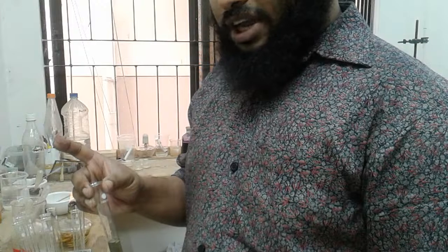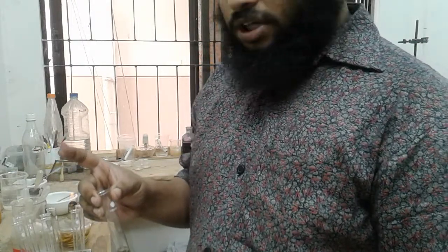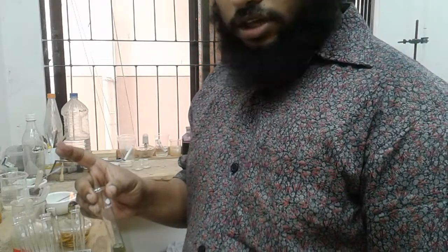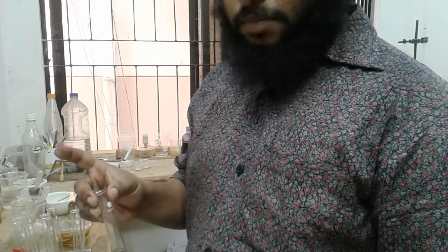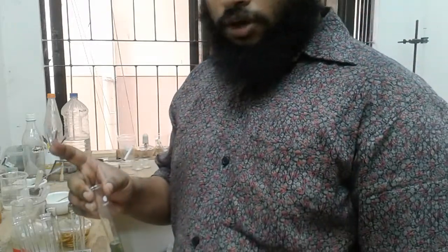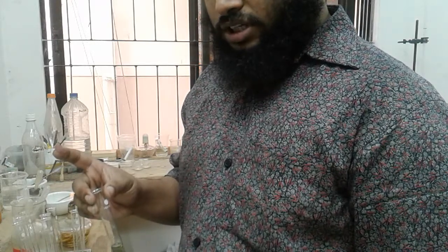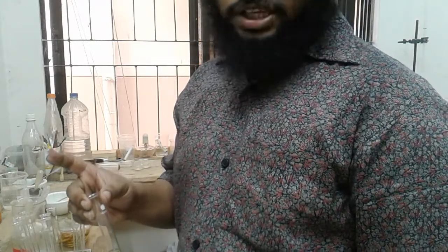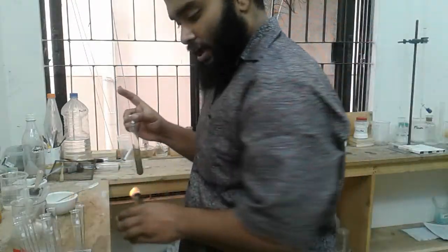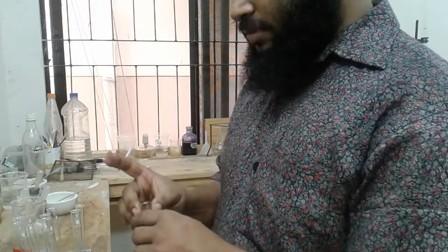There are only a few possibilities: it may be ammonia, it may be oxygen, or it may be NO2. NO2 is optional, but it may be NH3 for quite sure. And you don't need to taste the gas, you can easily identify it by its pungent smell.